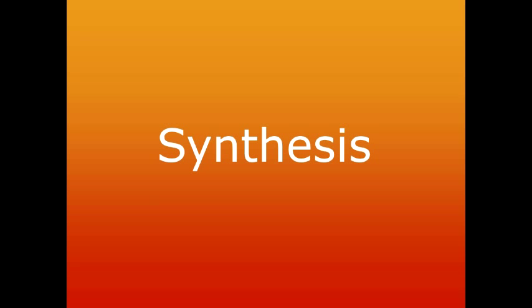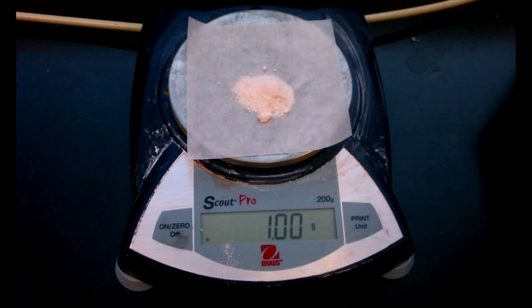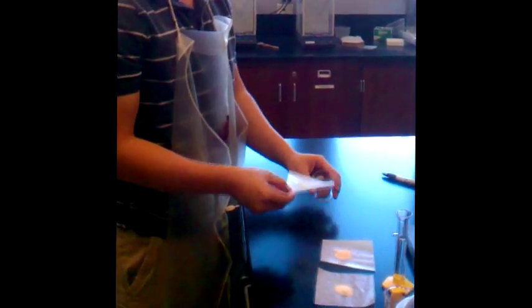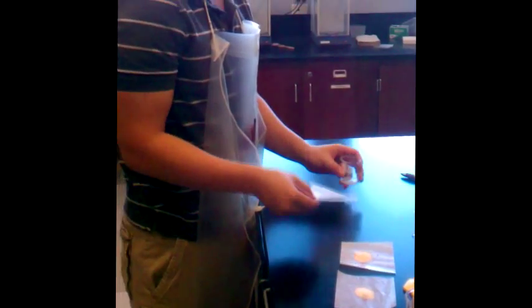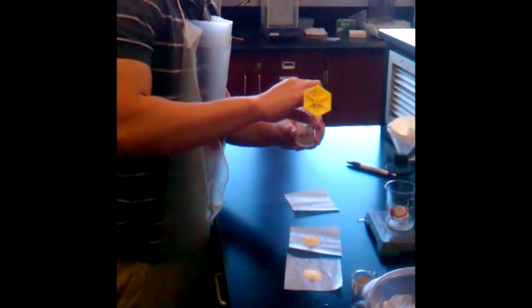We will first begin by weighing out 0.86 grams of ferrous ammonium sulfate and 1 gram of FEN. It is essential that you take the initial weight of both ferrous ammonium sulfate and FEN because they will be used when calculating the theoretical yield. Next, we will take the 0.86 grams of ferrous ammonium sulfate and transfer this to the 50 mL beaker. 10 mL of 1 molar HCl is added to dissolve the crystals. You may stir the solution to dissolve it quicker.